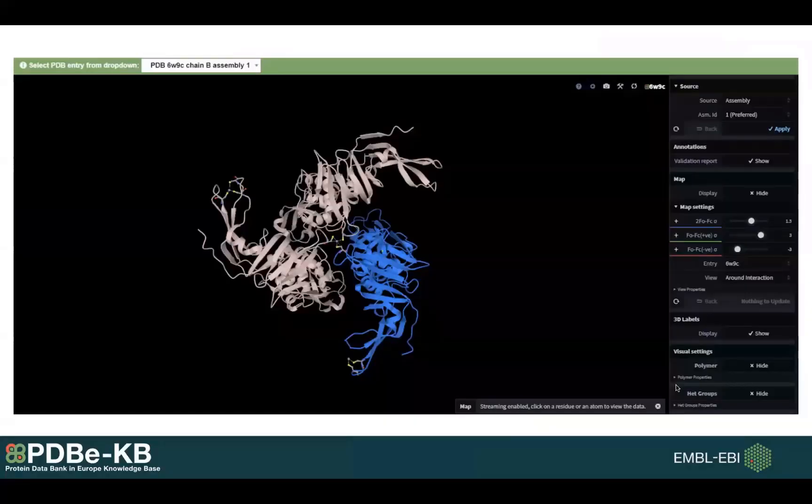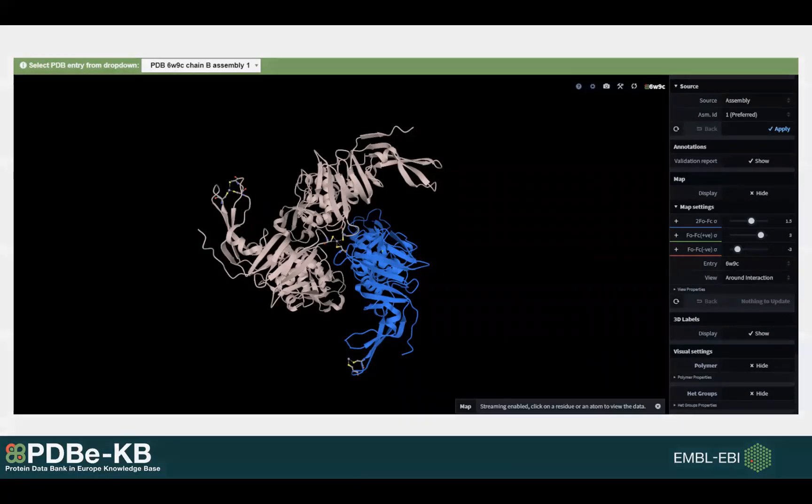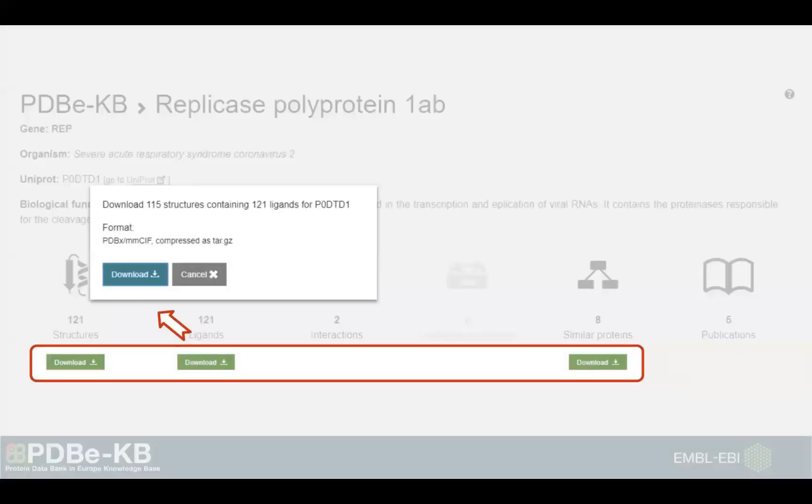If you click on any of these images, you get to an interactive 3D viewer called MolStar. You can also download all the coordinates for different options. For example, if you want to get all those PDB entries where there are small molecules, you can just click here and you will get 115 different PDB entries.